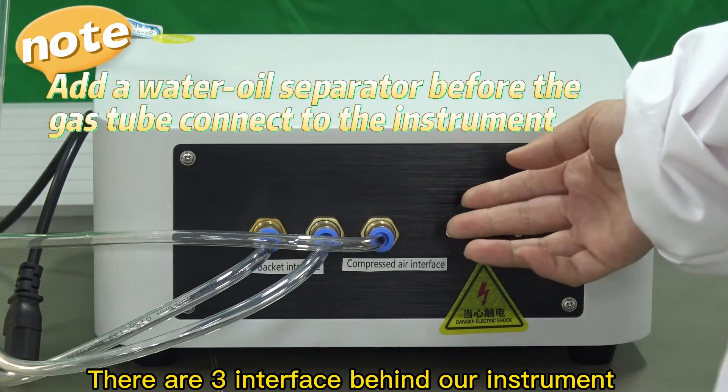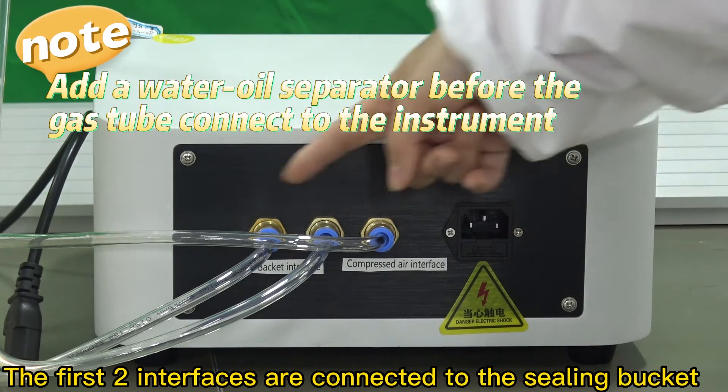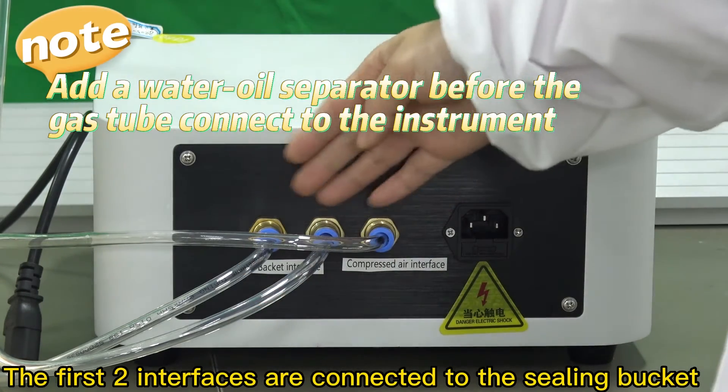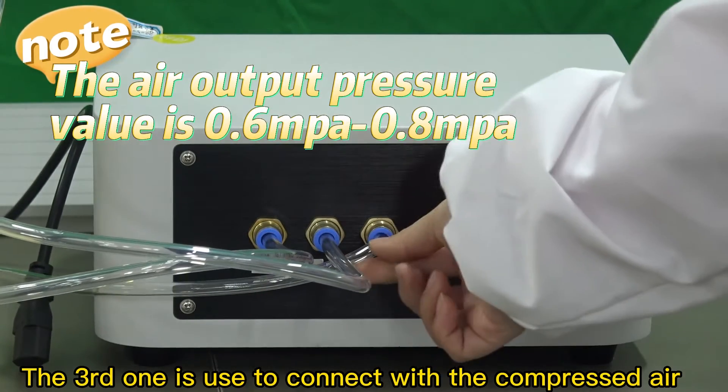There are three interfaces behind the instrument. The first two interfaces are connected to the sealing bucket. The third one is used to connect with the compressed air.